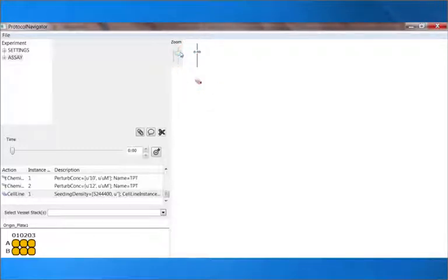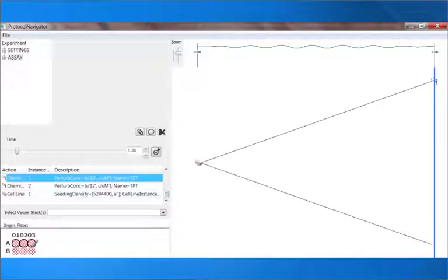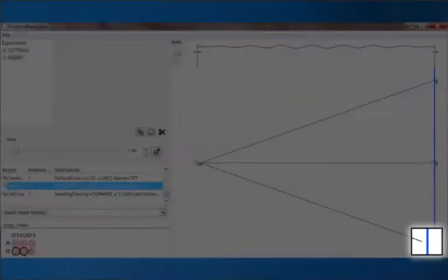After some time, chemical instance 1, which is the drug, was added to well A01, 2, and 3, and different concentration of the same drug was added to well B01 and 2. No drug was added to B03 at this time. So basically, cell samples were grouped into 3 sets. First group with drug concentration instance 1, second group with 2, and the third group no drug or control.